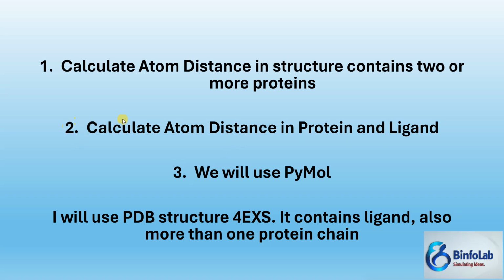You will be able to find information on YouTube from different people about point 2, but very few people have covered this point. So our main task is this, but then I realized, why not cover both of them? So today we will cover both of them in a short time. And the last thing, we will use PyMol.